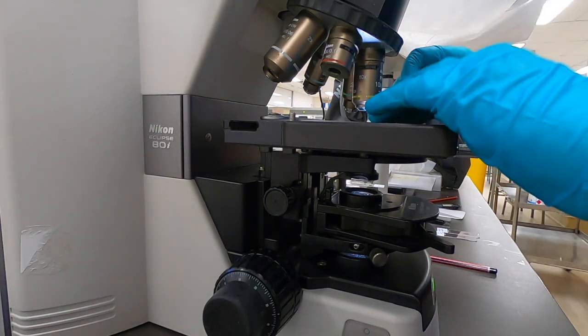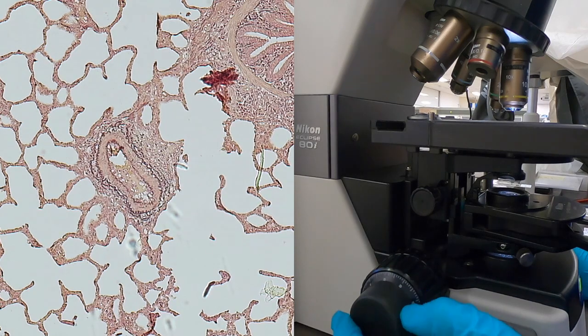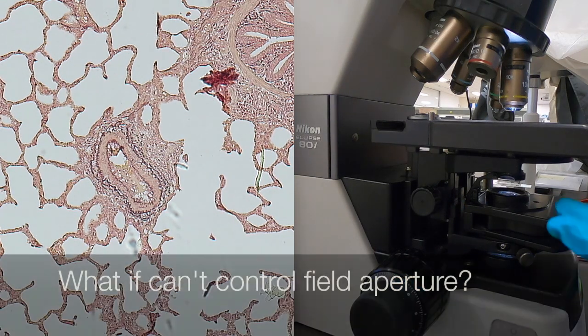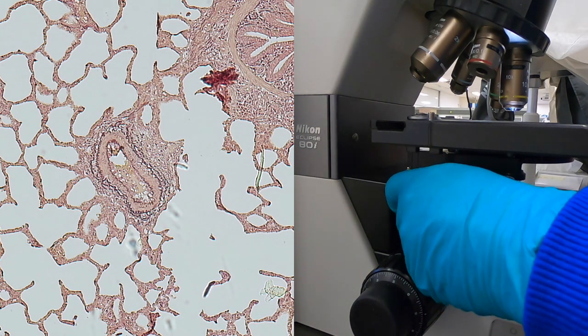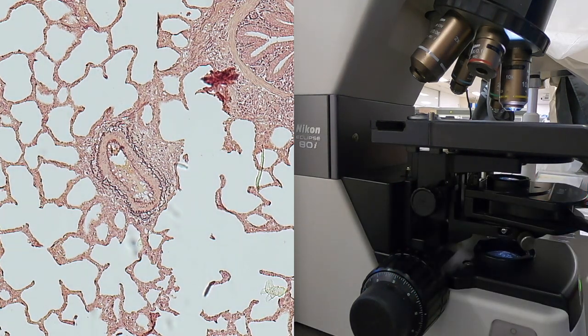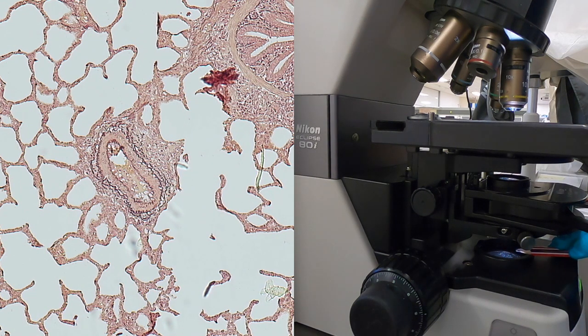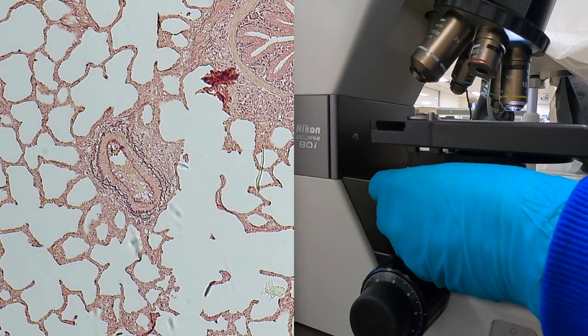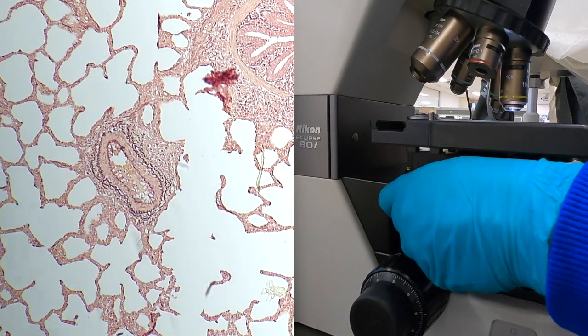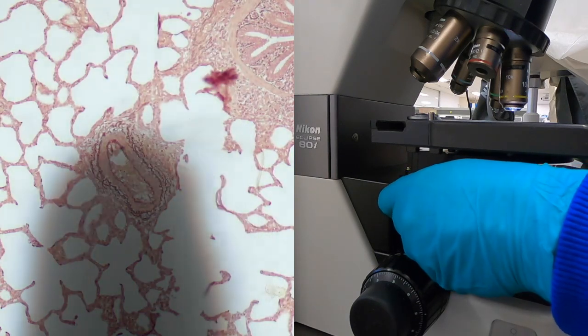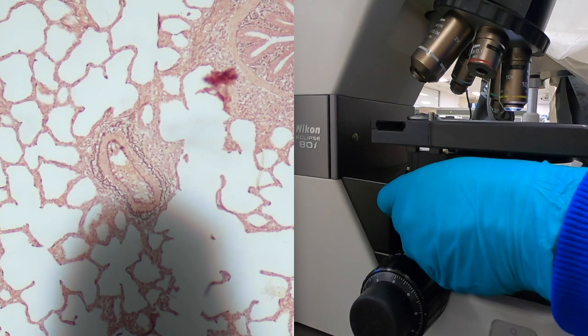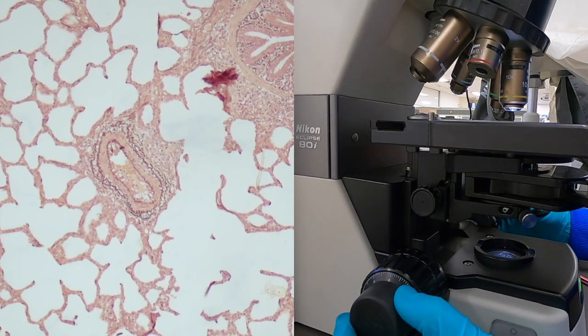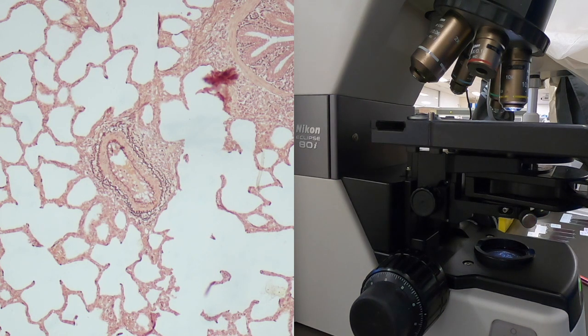So that's how things work in principle if you have access to full control over your field aperture as well as your condenser. But what if we look at a situation here where we assume that there is no field aperture control? We need some point of focus in order to achieve the correct height of our condenser. This is way out of alignment, so I'll bring that up a little bit. As demonstrated earlier using a pen, if we use a sharp pencil in this case, place the tip of that pencil as close as possible to the glass in order to get a similar result to focusing on the field aperture. Then just bring the condenser into focus such that that tip of the pencil is as clear as possible. It's a little bit fiddly, but it gives you something that is close to the same effect as focusing on the field aperture.